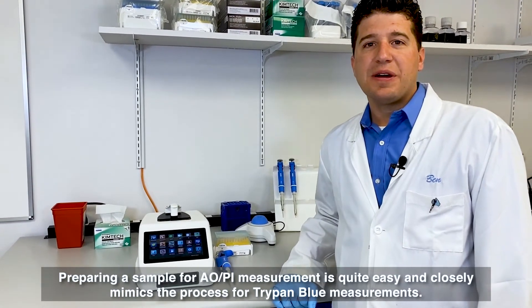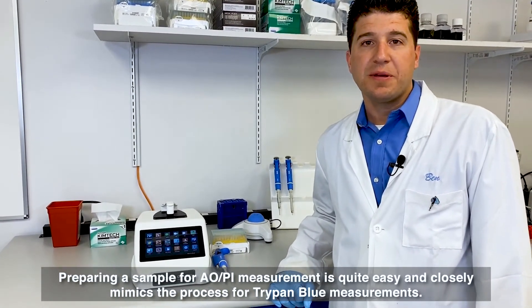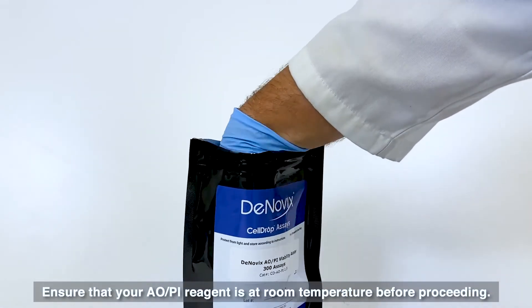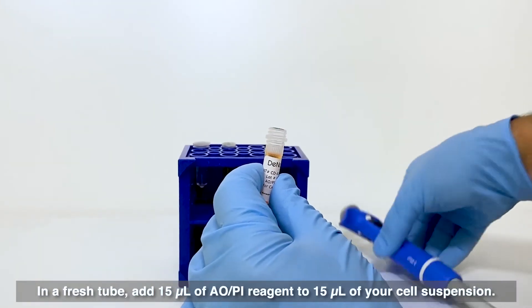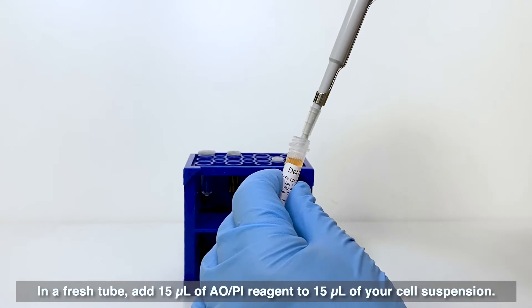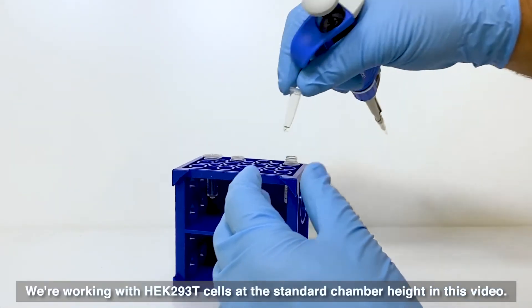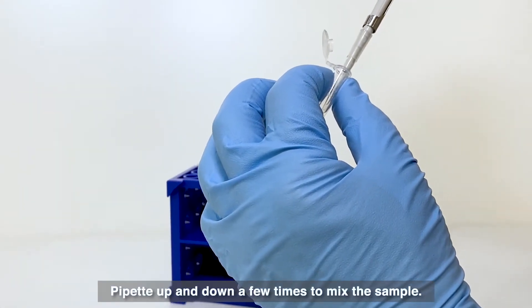Preparing a sample for AOPI measurement is quite easy and closely mimics the process for trypan blue measurements. Ensure that your AOPI reagent is at room temperature before proceeding. In a fresh tube, add 15 microliters of AOPI reagent to 15 microliters of your cell suspension. We're working with HEK 293T cells at the standard chamber height in this video. Pipet up and down a few times to mix the sample.